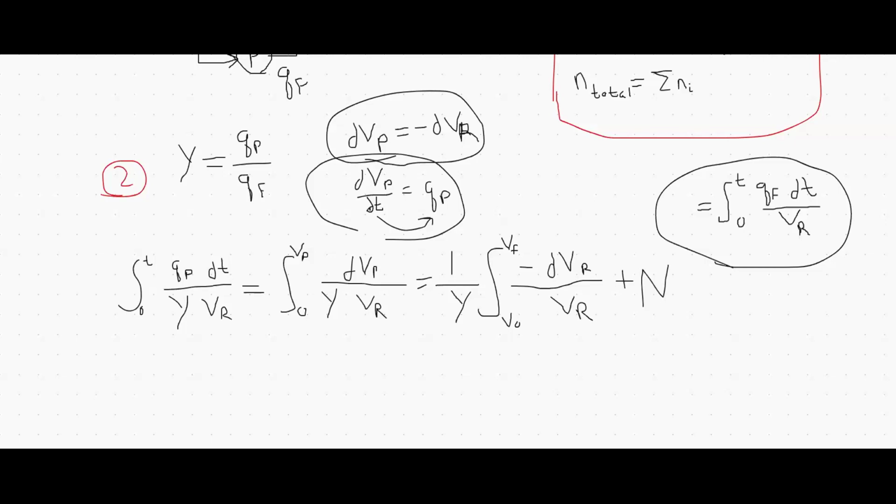A diavolume is equal to the volume in your retentate during a diafiltration. So if you do one diavolume, you've pumped all the volume in your tank through the pump one time. So that makes sense.